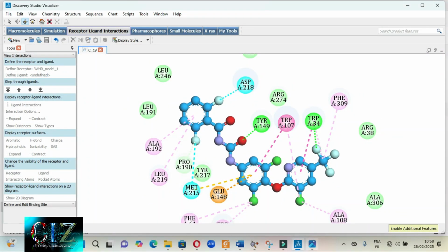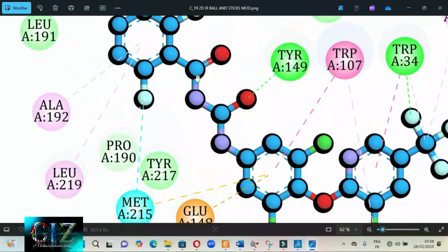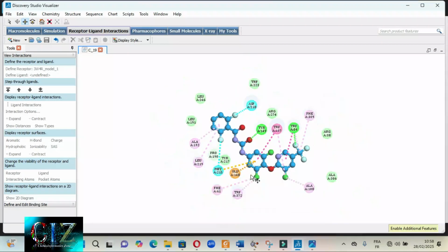This quality of image is the same as here, and I've already explained why I have dark zones in my images, and for which reason it's supposed to not be the case on your computer when you are doing your own work.